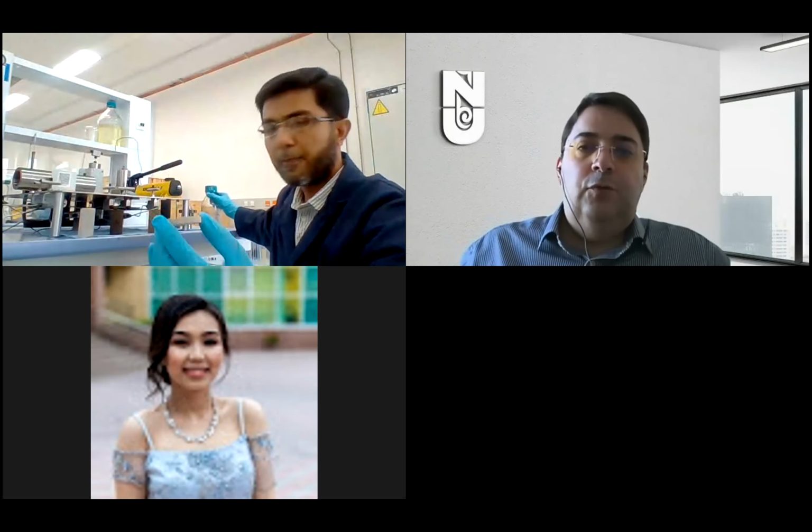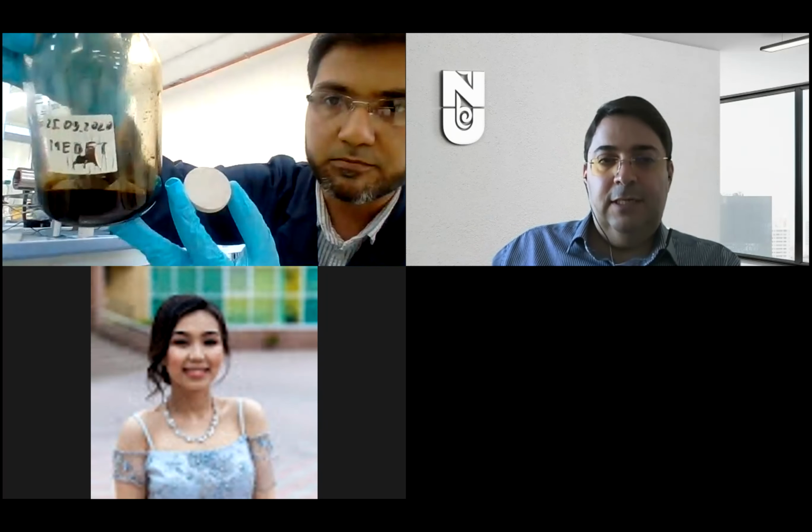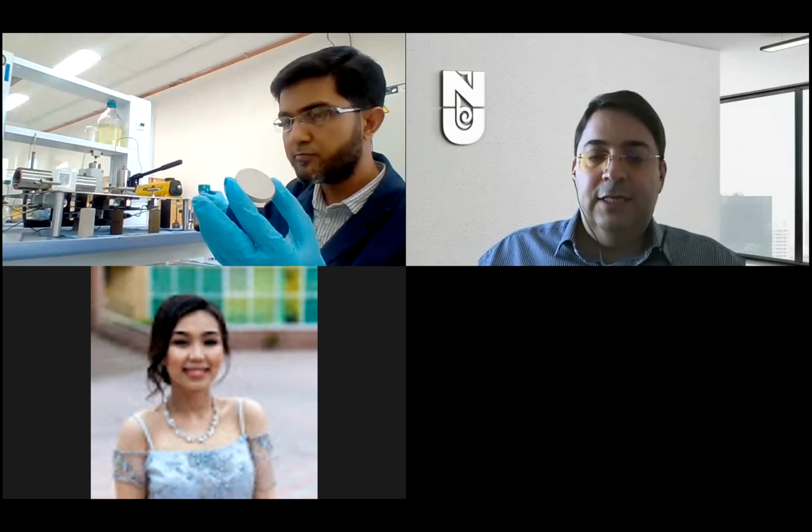When Rizwan talked about interaction, it means that, for example, we have a rock with oil on it, similar to this one. You see, this rock is in this bottle with oil. Now, if we have this piece of rock, how can we extract and remove oil from it? From the interaction, it means what kind of chemical, what kind of water, or what thermal method is good to separate the oil from the rock. We are looking for these interactions, and now Rizwan is showing you one of these cases on a piece of rock.